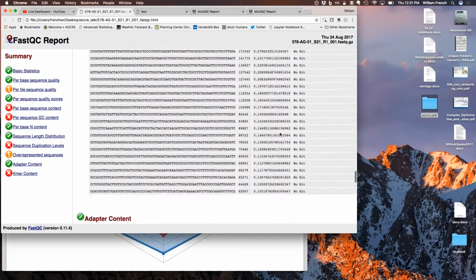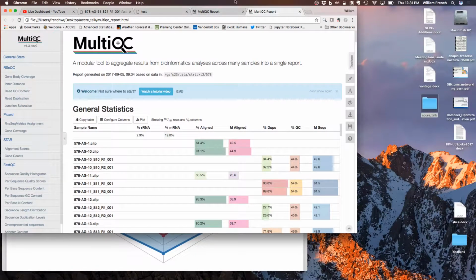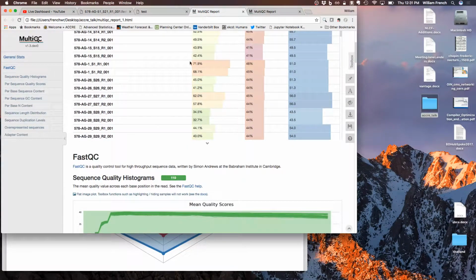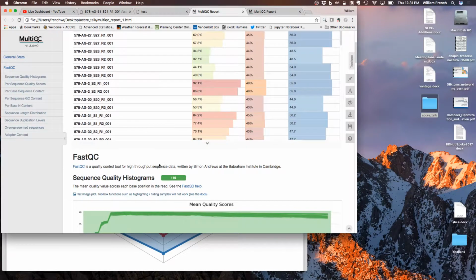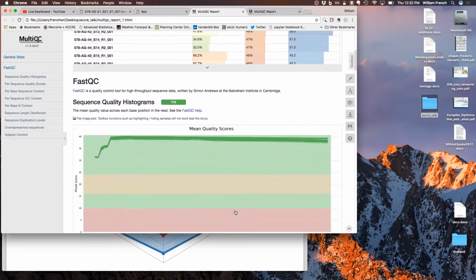But lots of other information here can be very useful in interpreting your results. And then you can pull this. So I generate one of those files for every FASTQ file, for which I have 2 for every sample. So if I have a large sequencing project, that's a lot of HTML files to go through. MultiQC pulls them all together for me, so I can rapidly identify problems. We have some bad samples here with a high duplication rate. These are probably RNA from FFPE. There's probably a very small amount of RNA that got put in, and so we had a lot of PCR duplicates. This is helpful in terms of being able to diagnose problems, throw out bad samples, and decide whether we're going to resequence or not. And you can go through this HTML doc much more quickly and look overall at the project.